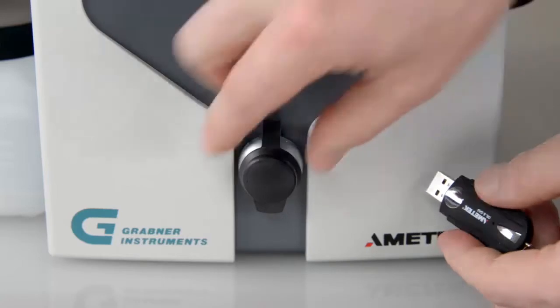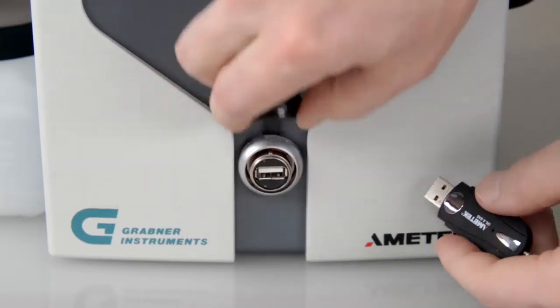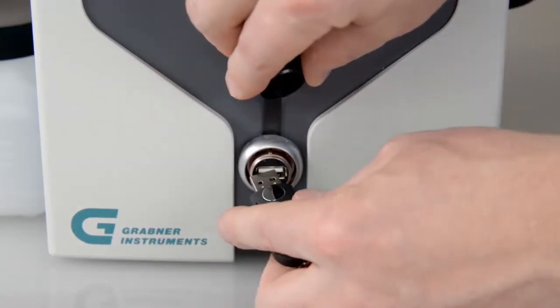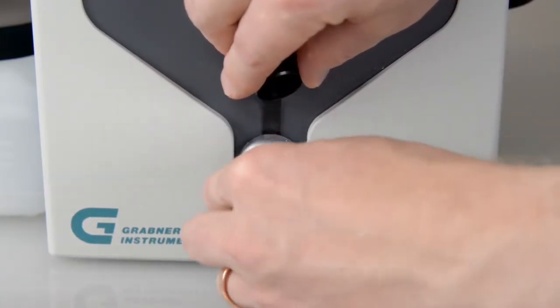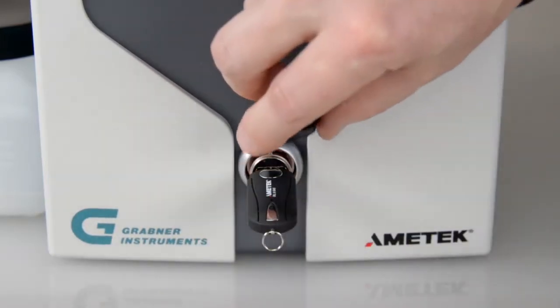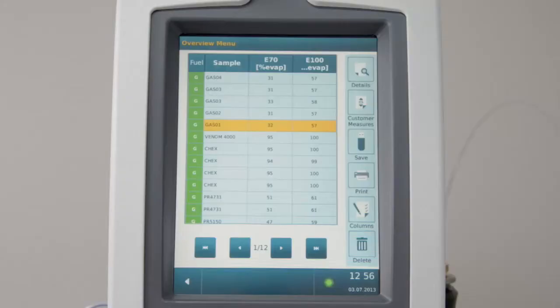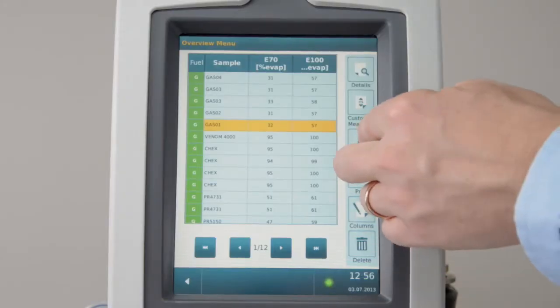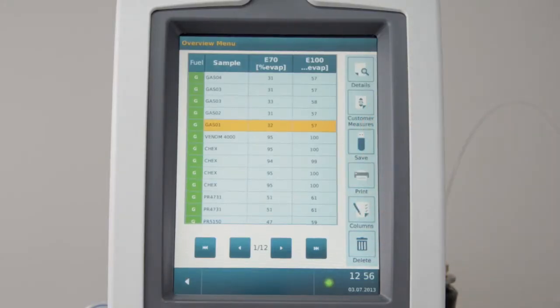To save results, insert a USB device to the front port. To save all results, click Save in the results list.